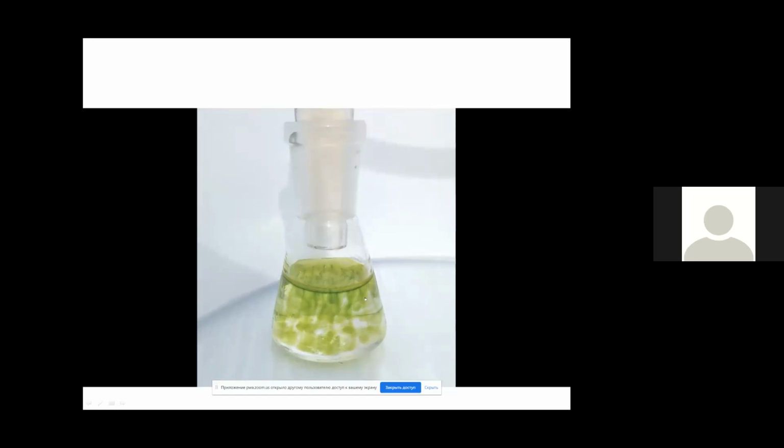It goes into solution slowly, without stirring. It's a slow process. Please pay attention to the surface of the solution. Then slowly appear brown spots, brown coloring. It means that at the surface appears more and more singlet biradical. Of course, if you mix the mixture, there is a lot of starting compound, and there will be co-proportionation between singlet radicals.